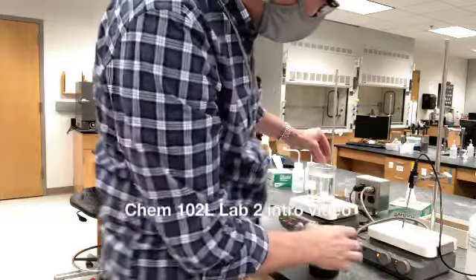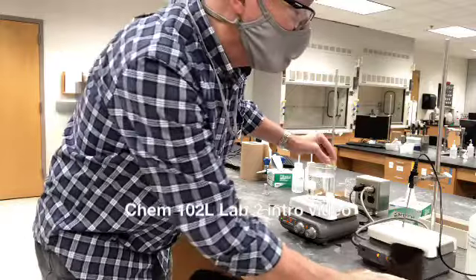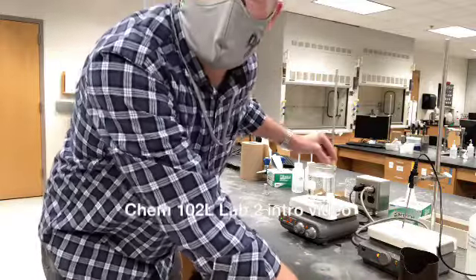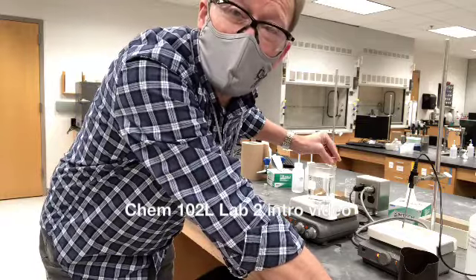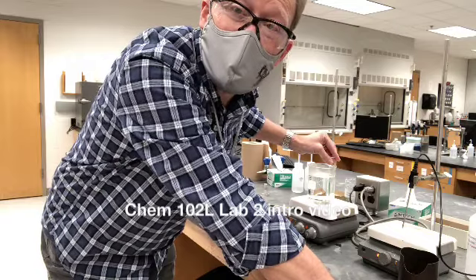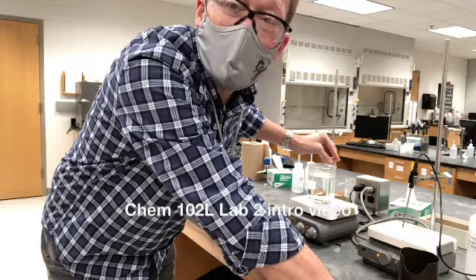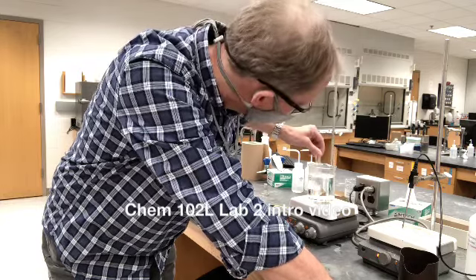We want to be sure that all that solute gets dissolved into the lauric acid. That's going to give us that new mixture, and the freezing point depression is going to help us to know what the concentration is. The concentration units will be molality, so you'll have to take that into account. Those units, a different unit of concentration.